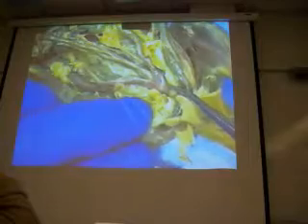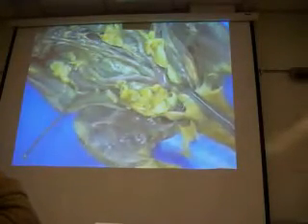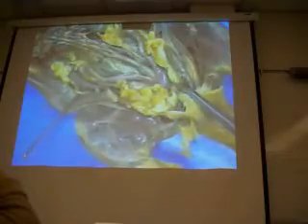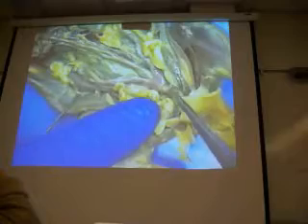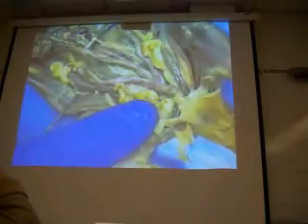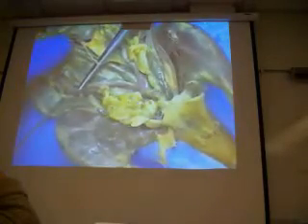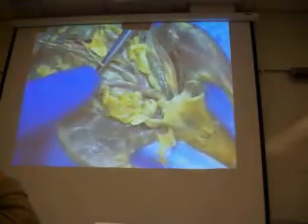And oftentimes in anatomy, people are always poking the bladder, and finally poke it enough, and there's a little hole that develops and it squirts your lab partner, if not yourself, in the eye. So here's the bladder right here. So here's the ureter. If I ask ureter questions, I'll make sure that you can see it coming out of the kidney.